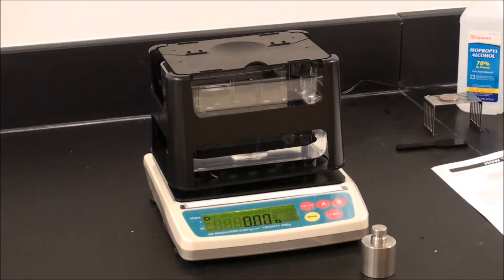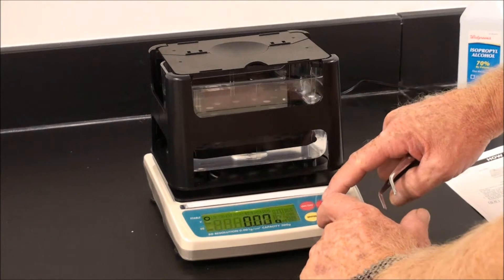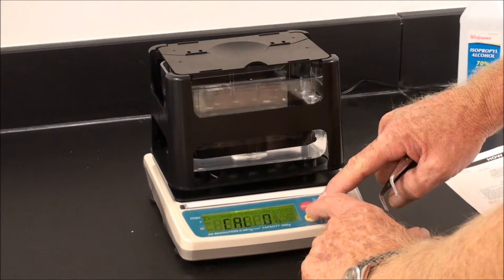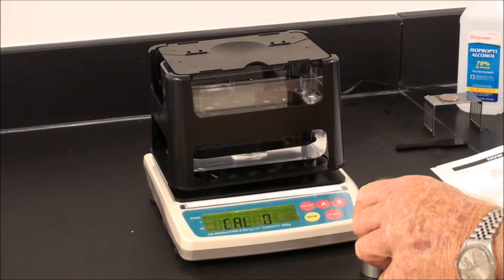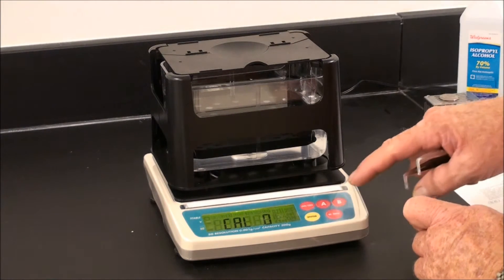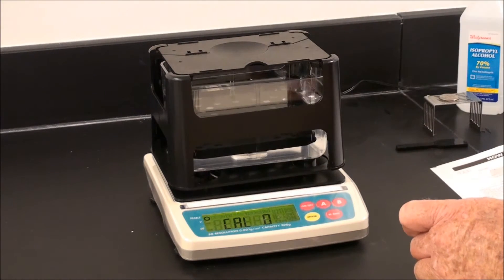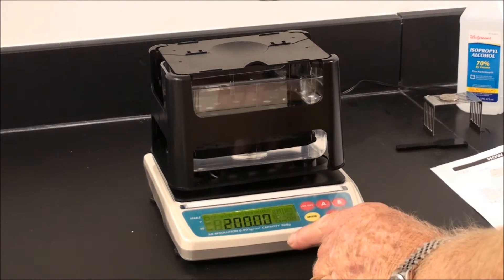To calibrate, hold down key A and press ENTER until CAL is displayed. Now you see CAL zero. Press the B key. The stability mark will appear. Take the 200 gram weight, as shown in the display.